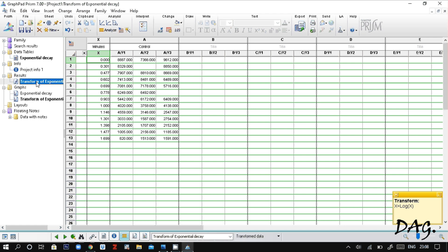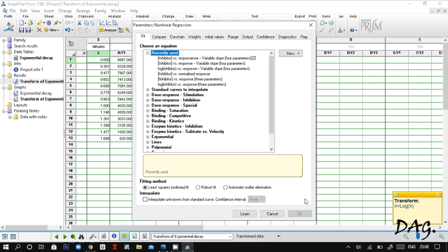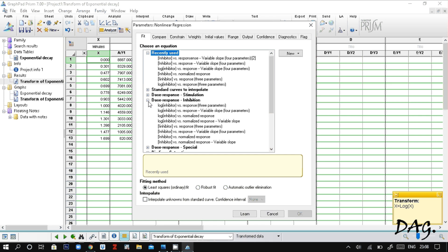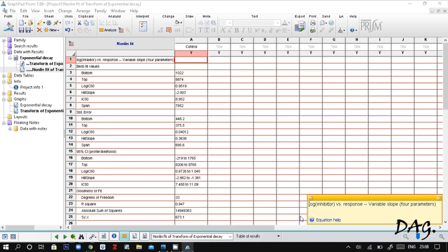Now select the log transform data sheet and click Analyze, then nonlinear regression. Click Okay. Since our data has to do with inhibition, go to 'Log Dose Response Inhibition' and select 'Log Inhibitor versus Response'. Now GraphPad Prism calculates your IC50 value for you. As we can see, we have our IC50 value.